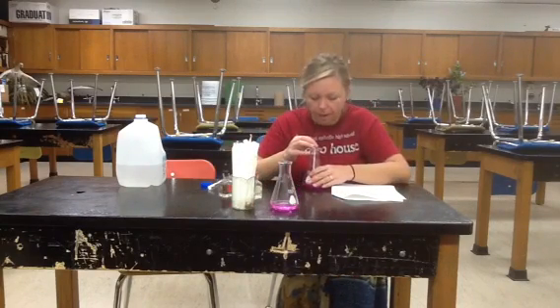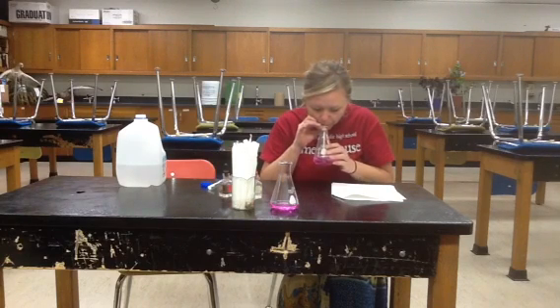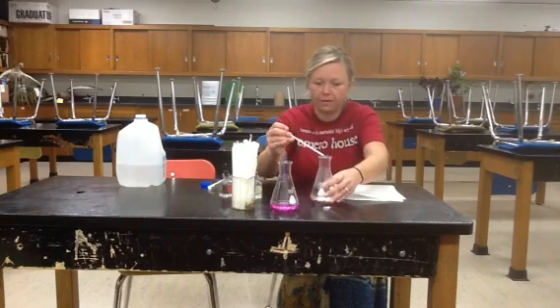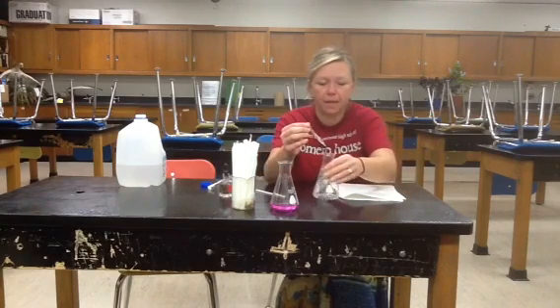So after you've exercised, you're going to blow in your bottle again, or your flask, for 20 seconds until it turns clear. Okay, still, yep, we've got clear. You'll blow for 20 seconds until you've got that clear color. Then you're going to restore that light pink color once again by adding sodium hydroxide.